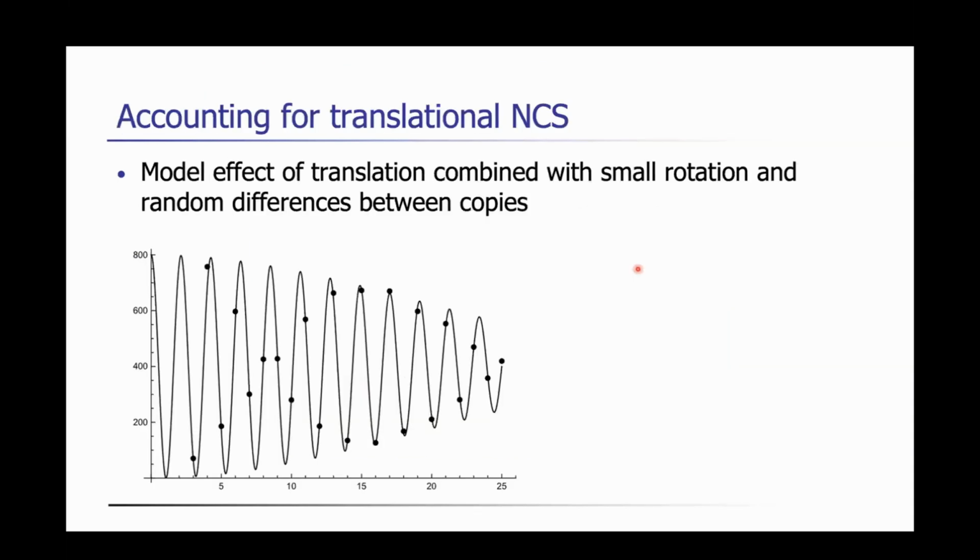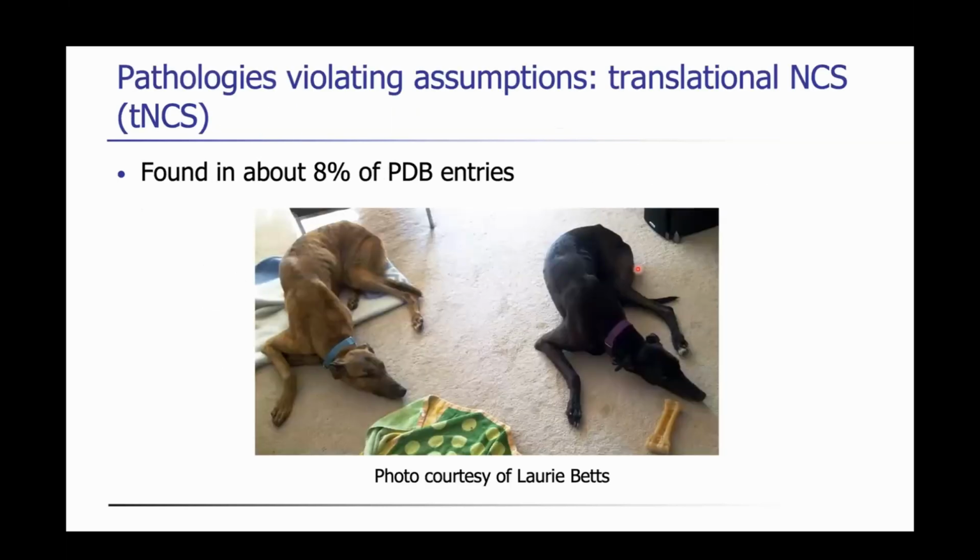The problem is that, let's get back to our dogs. You have some diffraction from this dog, then there will be waves coming off of that dog when it scatters the light. And if those waves are in phase with the ones that are scattered off of this dog, then they will be boosted up in amplitude. But if they're out of phase, they'll be canceled out.